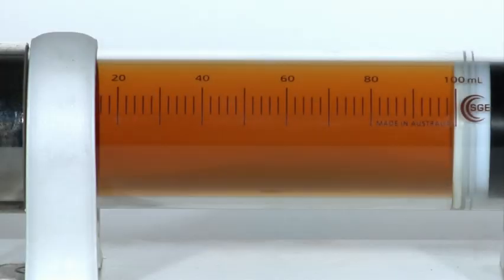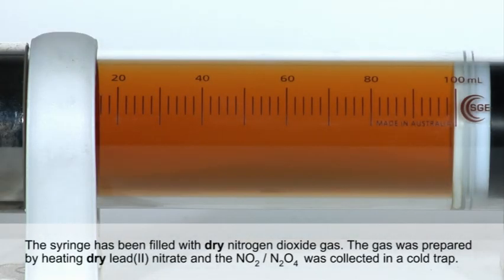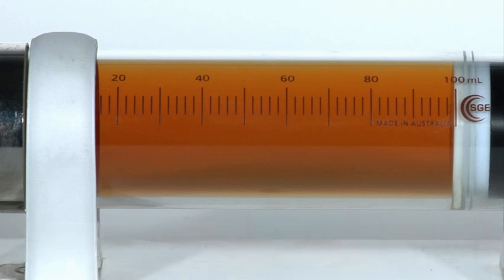Dry nitrogen dioxide was prepared for this demonstration by heating solid lead nitrate and collecting the gas formed in a cold trap at minus 60 degrees Celsius. Oxygen produced in the decomposition was allowed to escape to the atmosphere.